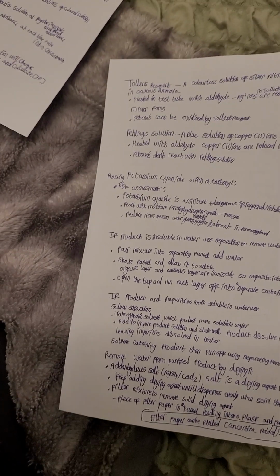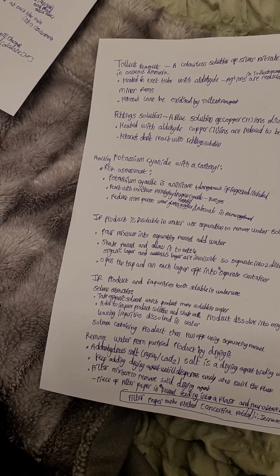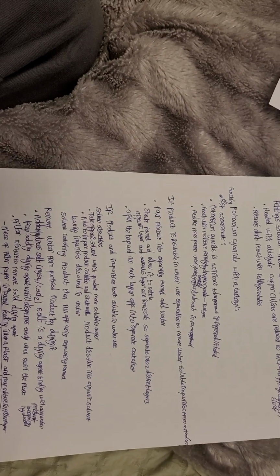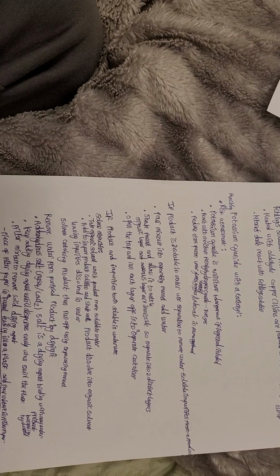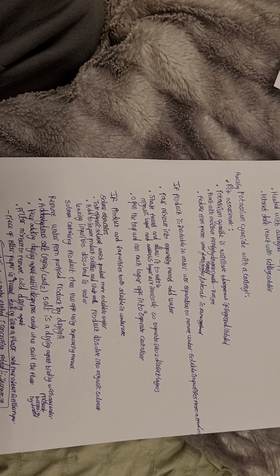If the product is insoluble in water, we want to use separation to remove water-soluble impurities from a product. So what we want to do is pour the mixture into a separating funnel, add water, shake the funnel, and allow it to settle. The organic layer and aqueous layer are immiscible, aka they don't mix, therefore it separates into two distinct layers. Open the tap and run each layer off into a separate container.